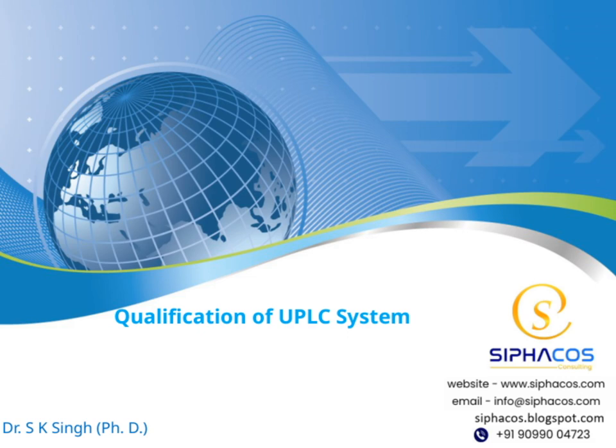Today, we will be discussing the qualification of the UPLC system. My name is Dr. S.K. Singh, and I hold a PhD in this field. Over the course of this session, we'll explore the key aspects involved in qualifying a UPLC system, including its installation, operation, and performance validation. I look forward to sharing valuable insights with you.